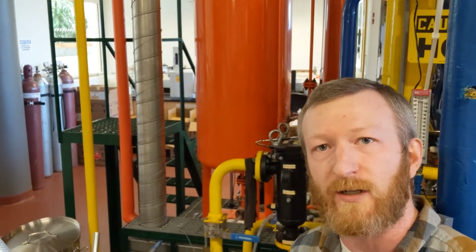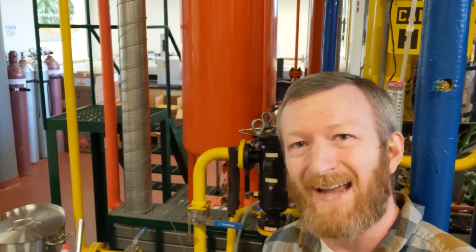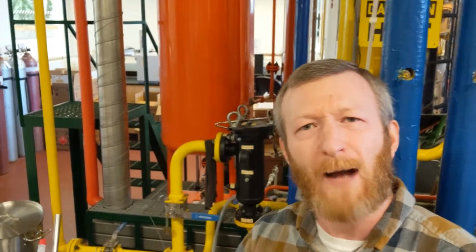In this tank over here, in that orange tank, is where we're going to mix up our chemicals for the reaction. It's going to be methanol and potassium hydroxide. We have a couple options on catalysts that we can use. We specifically choose potassium hydroxide because the catalyst isn't used up in the reaction, right? A catalyst is there to facilitate the reaction. We want that catalyst to be useful later on, right? We don't want it to just be a pure contaminant we need to deal with or something that we need to remove later on.